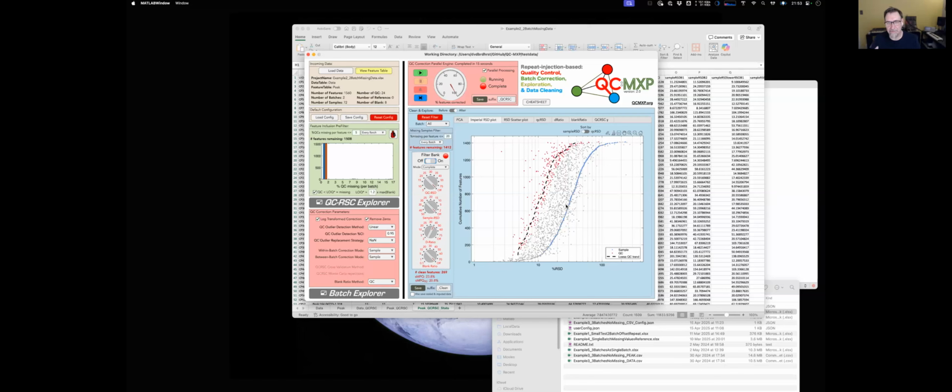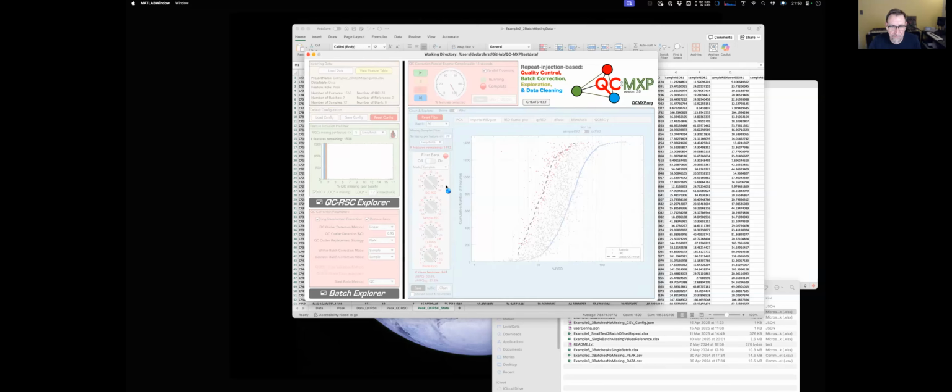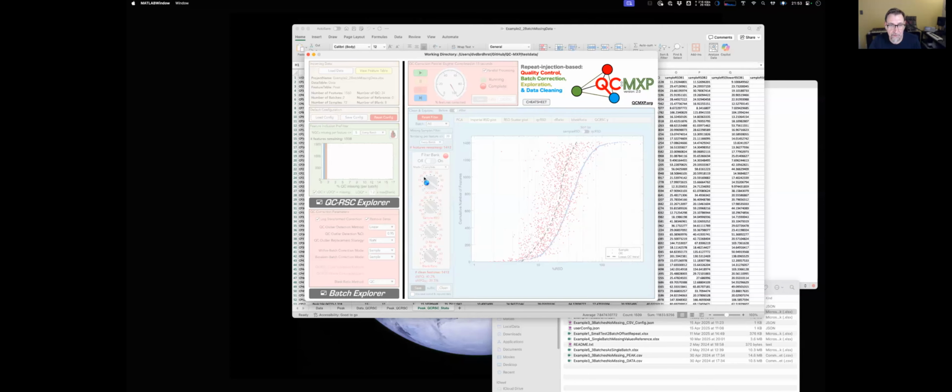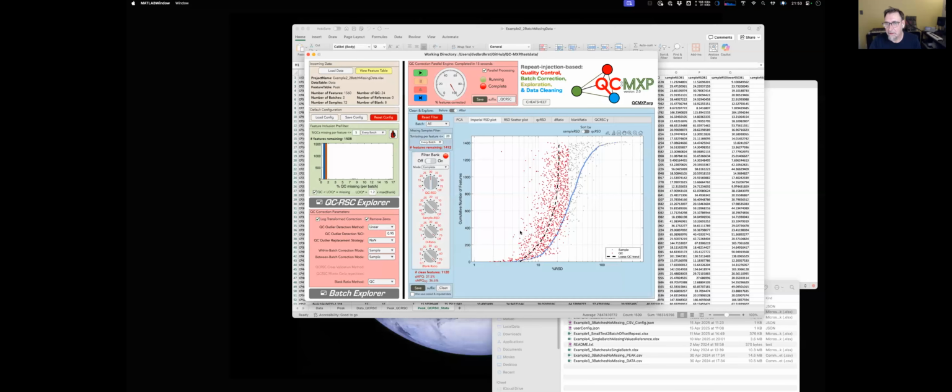That's basically saying those are the peaks with high information content. Now, if you just wanted to say which of those peaks have been reproducibly measured, from an analytical chemistry perspective, so you're really just focusing on the RSD, and let's be nice and say 30%. You know, there's still quite a lot there, but the actual information content is poor. So the validity of any statistics done on those features is equally going to be poor. So that's where the D ratio is.